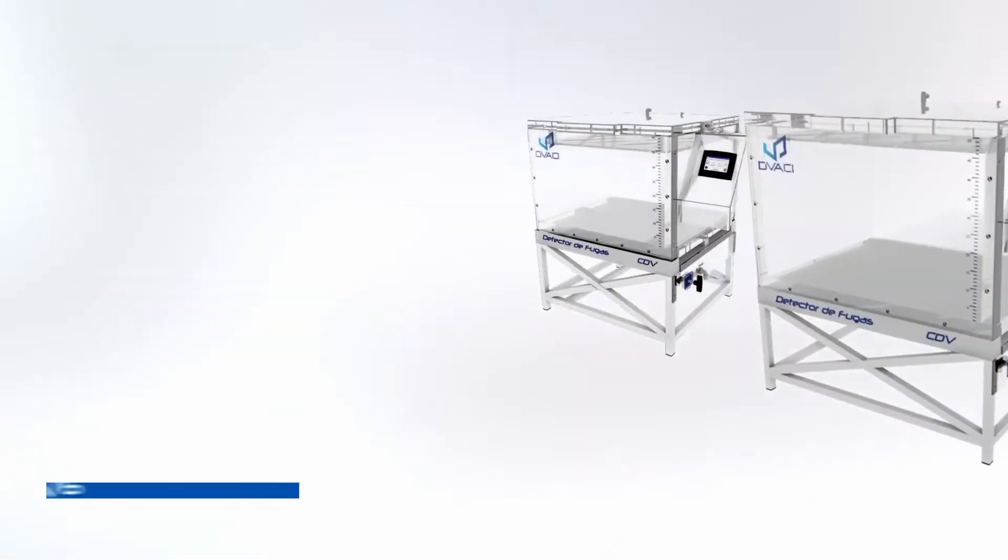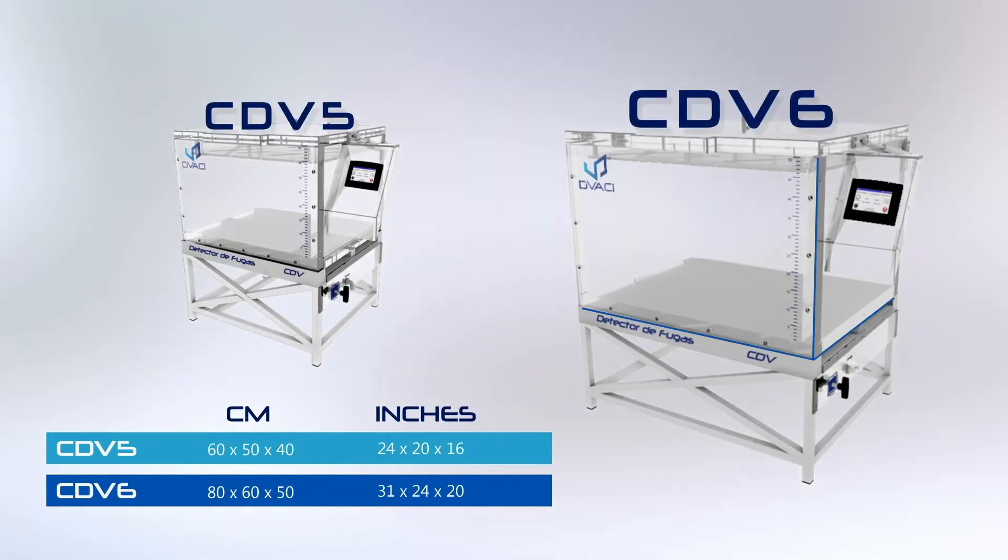Alternatively, the floor stand range of the CDV-5 and 6 are mounted on a wheeled base.